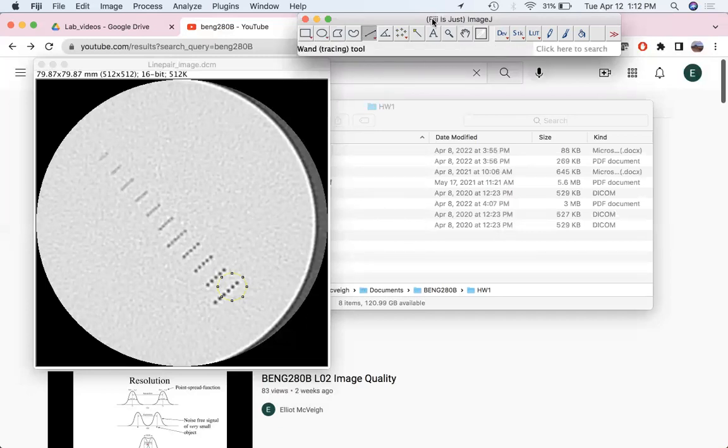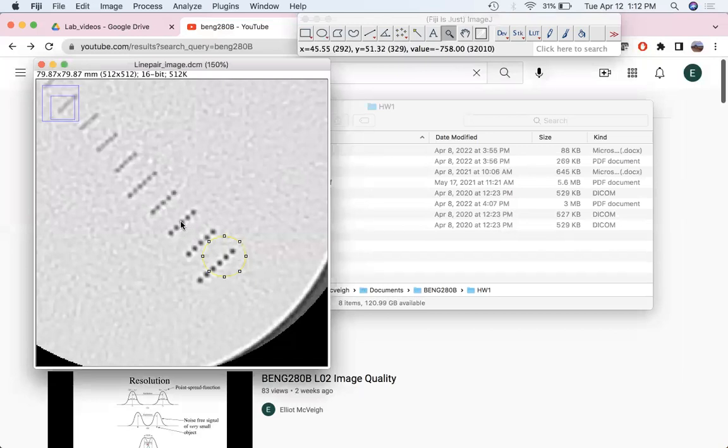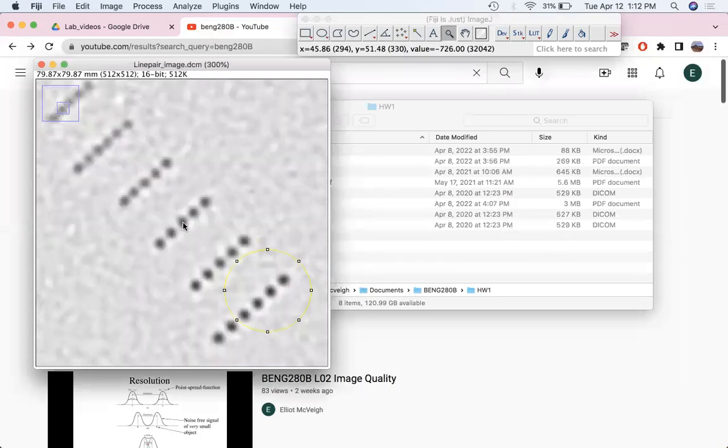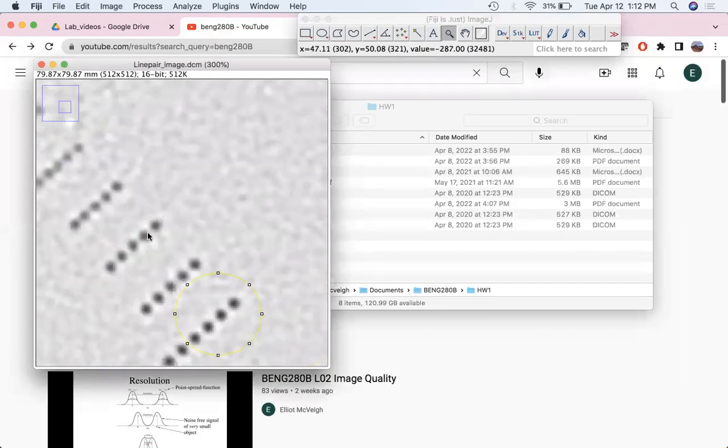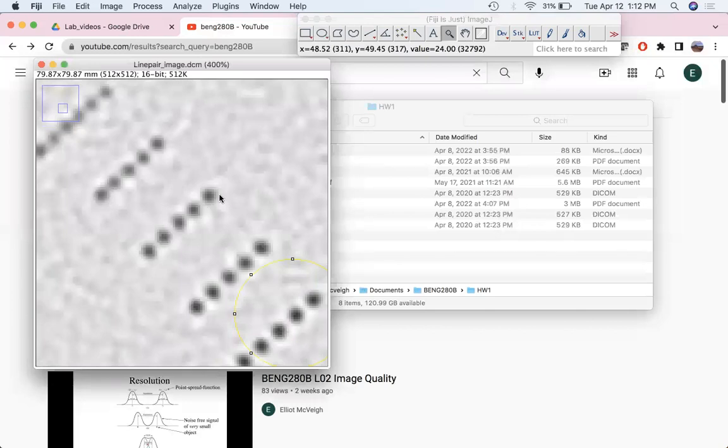And actually before that, let's magnify. So this is the magnifying glass, and we can go in and place it on a pixel, and every time we left click, it'll zoom up. And then on the Mac, you say command click, and it goes back.